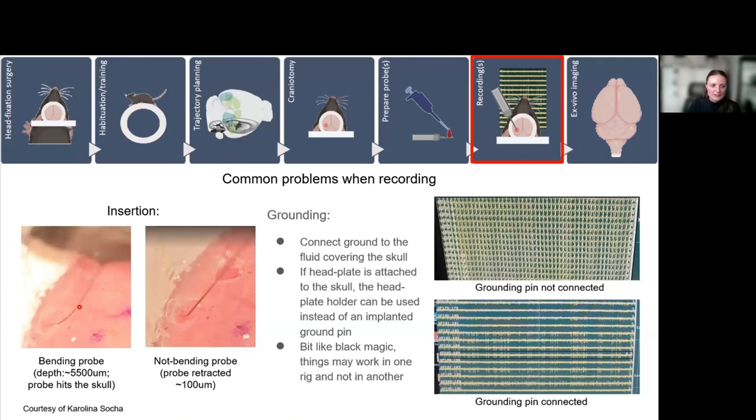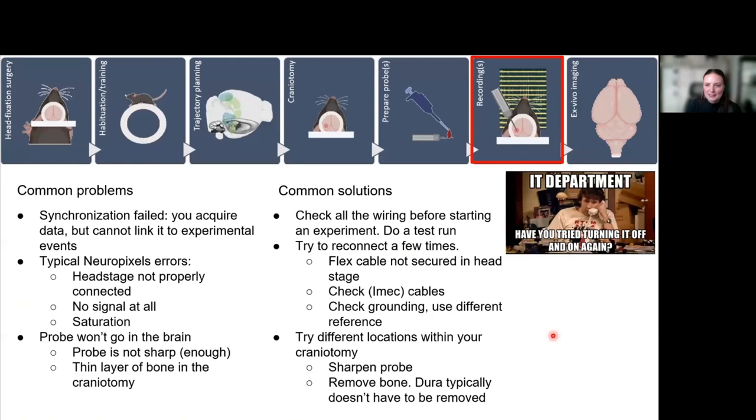There are a few common problems. One is insertion not going as planned because, for example, the probe bends. This is very scary at first when this happens. Just slowly go back up a little bit and try somewhere else or try again. Sometimes slightly higher speeds might help. If you see something like this, it means your probe is not grounded properly. Make sure to ground the mouse. I think this was already discussed by Carolina, so I don't have to go over this. Just keep checking the grounding. I don't have time anymore, but there are some common problems and common solutions. Feel free to read through them—the slides will be online.